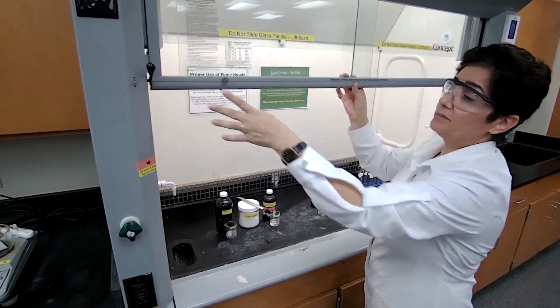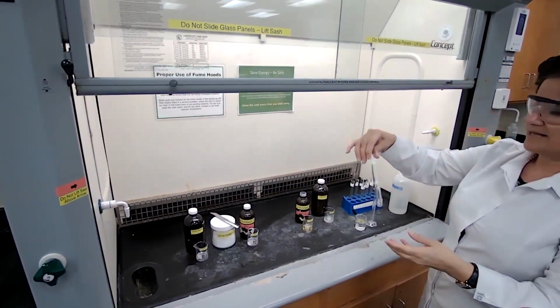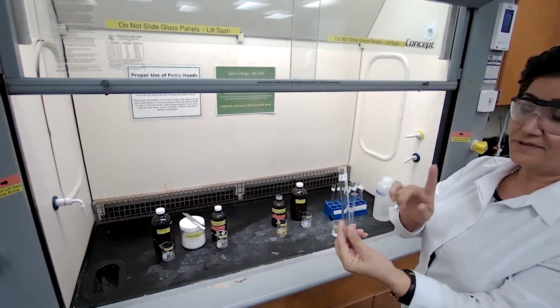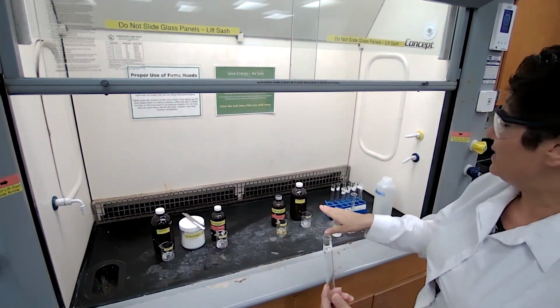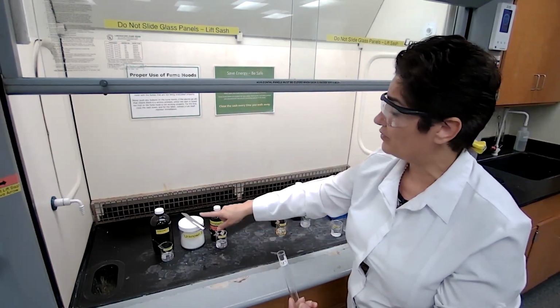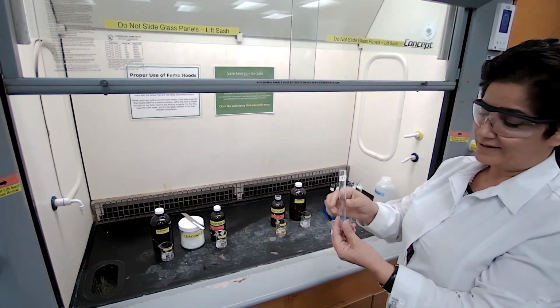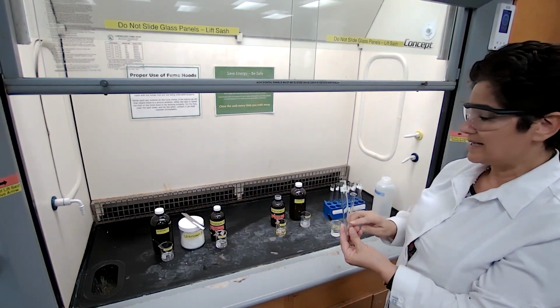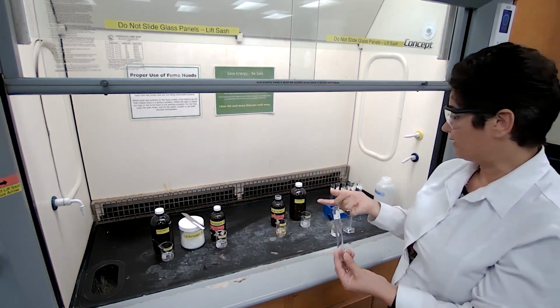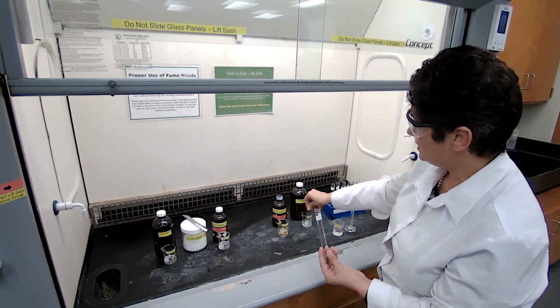Based on the procedure, we are going to take a test tube. I pre-labeled these test tubes. I already know that I have 6 test tubes because I have 6 unknown samples: unknown 1, 2, 3, which is a solid compound, 4, 5, and 6. If it's a liquid, we put 3 drops of the unknown liquid in a test tube, and we add 3 milliliters of water. So I'm going to add the unknowns first into the test tubes.